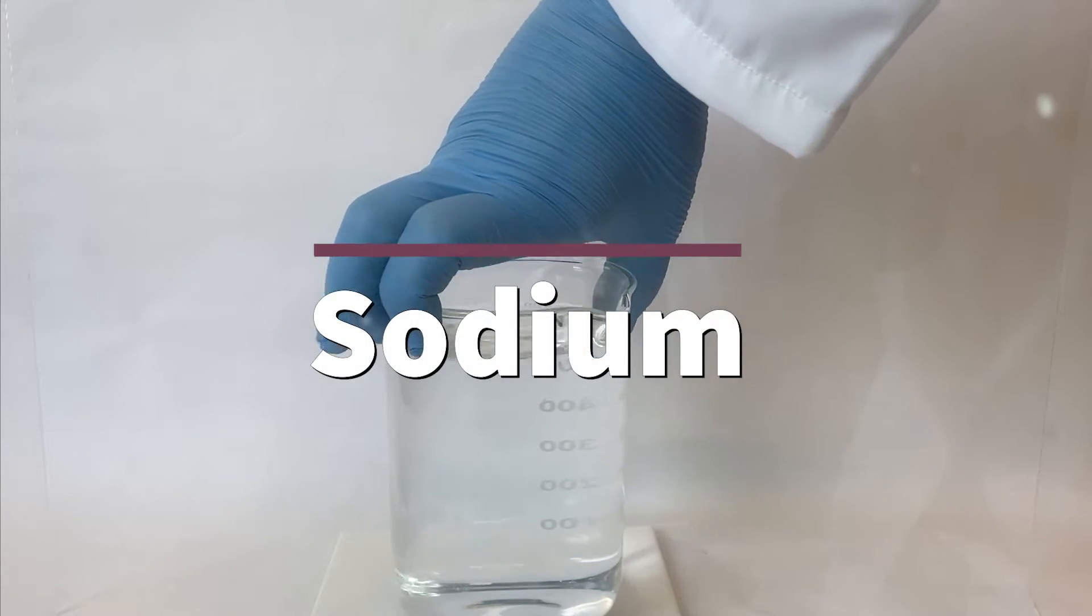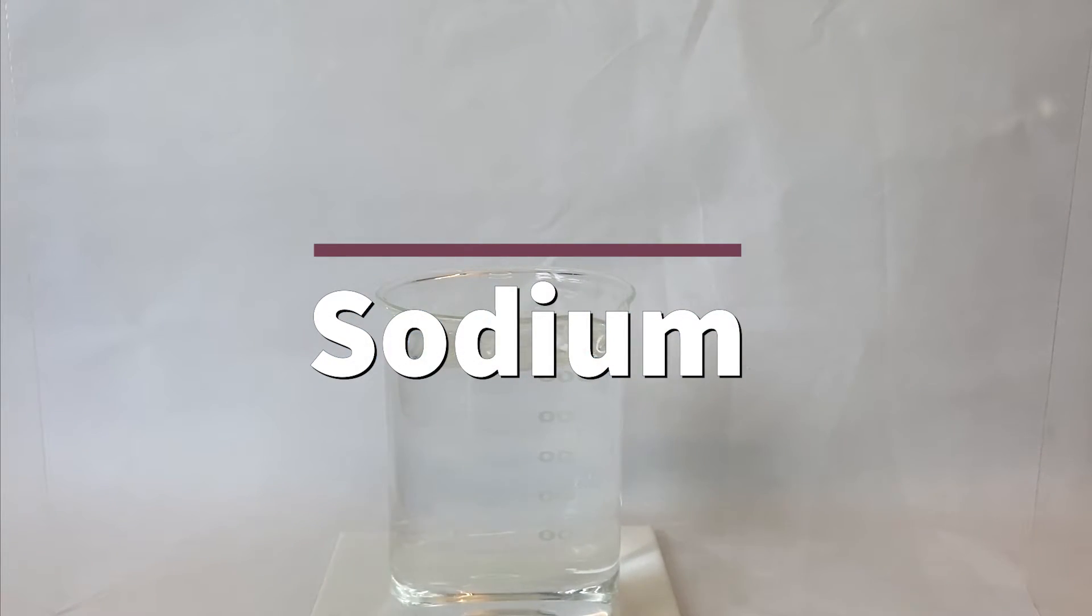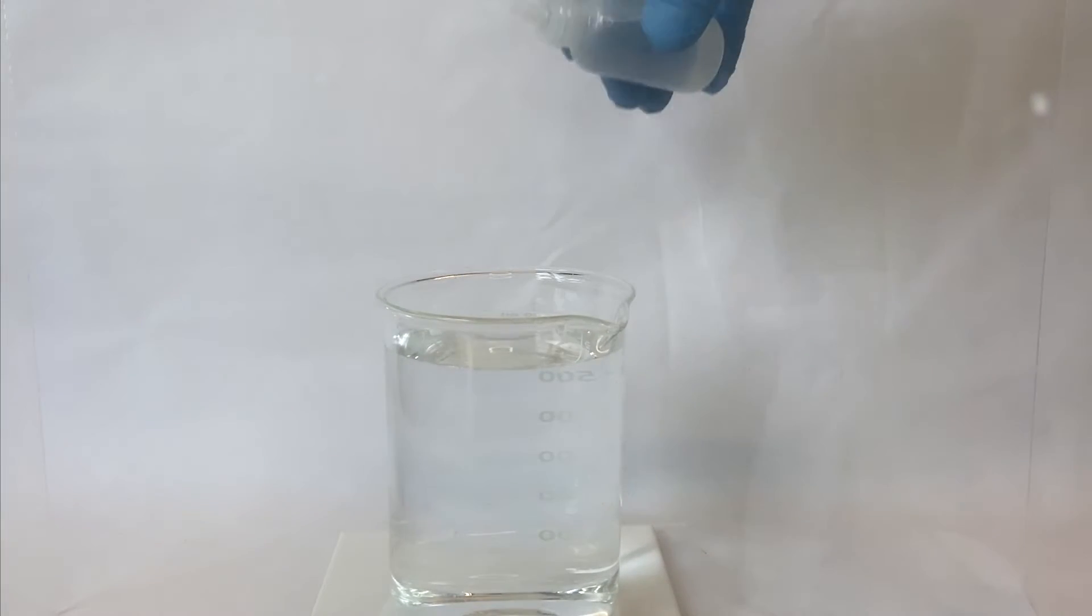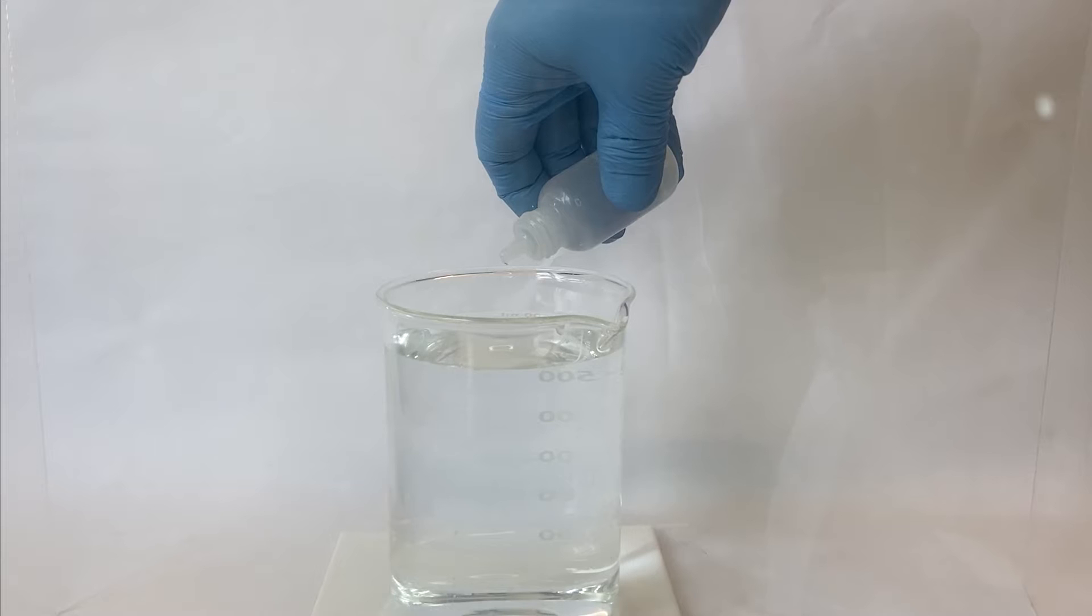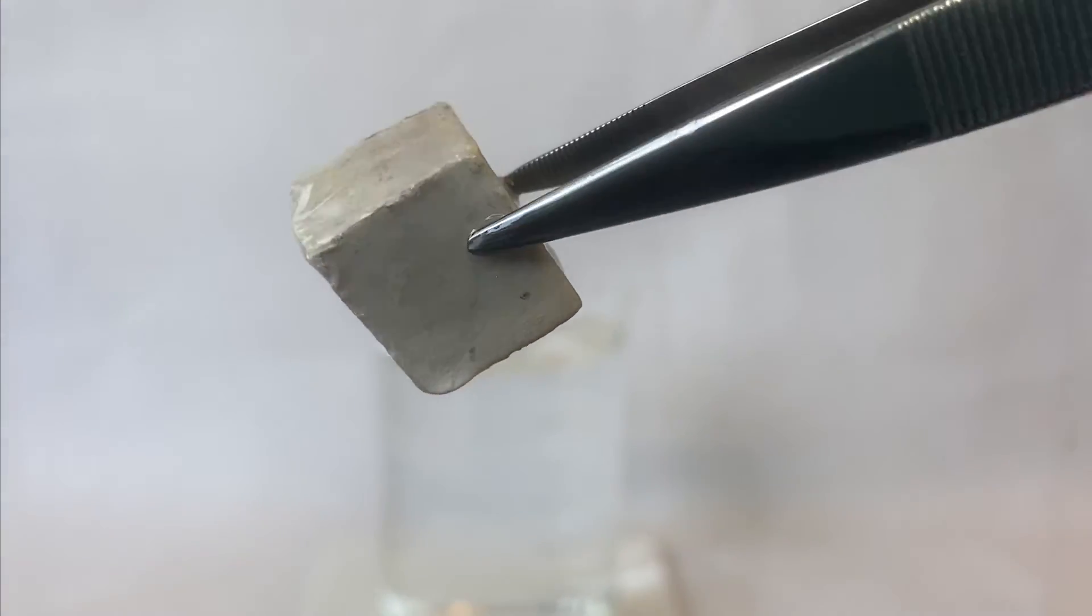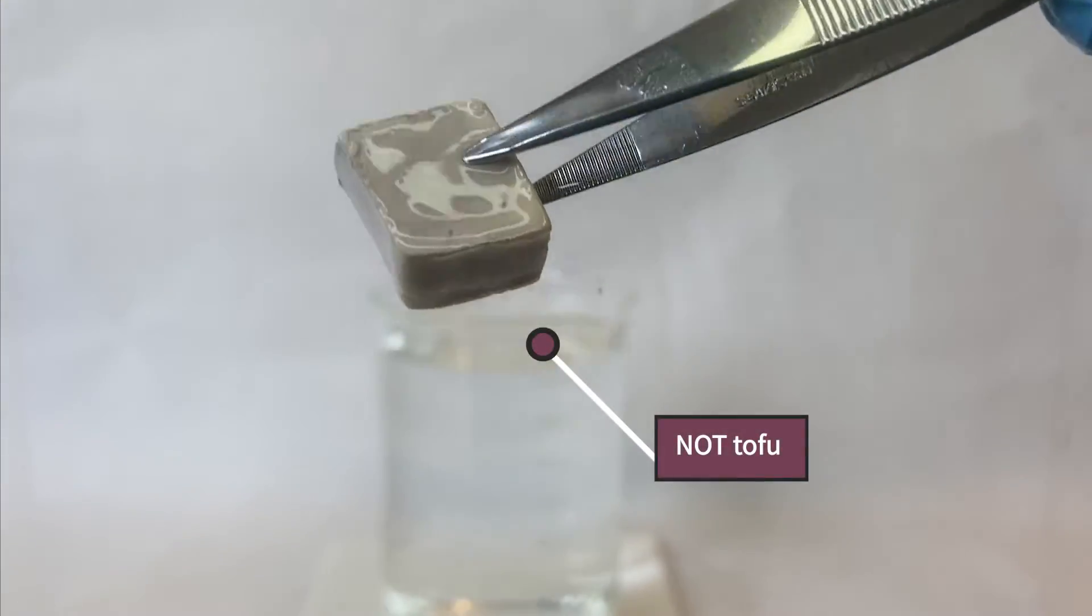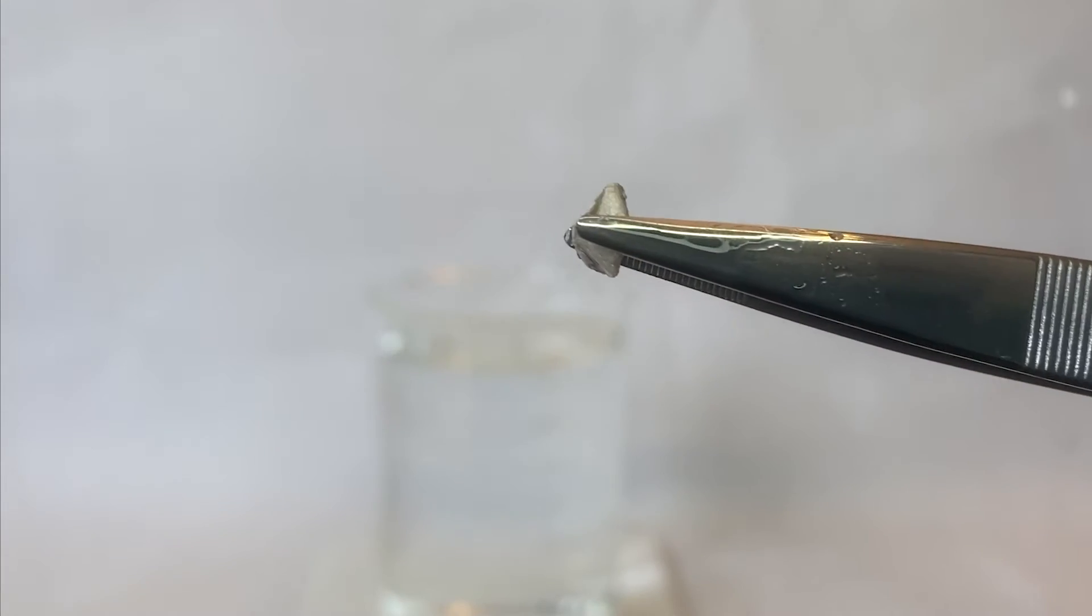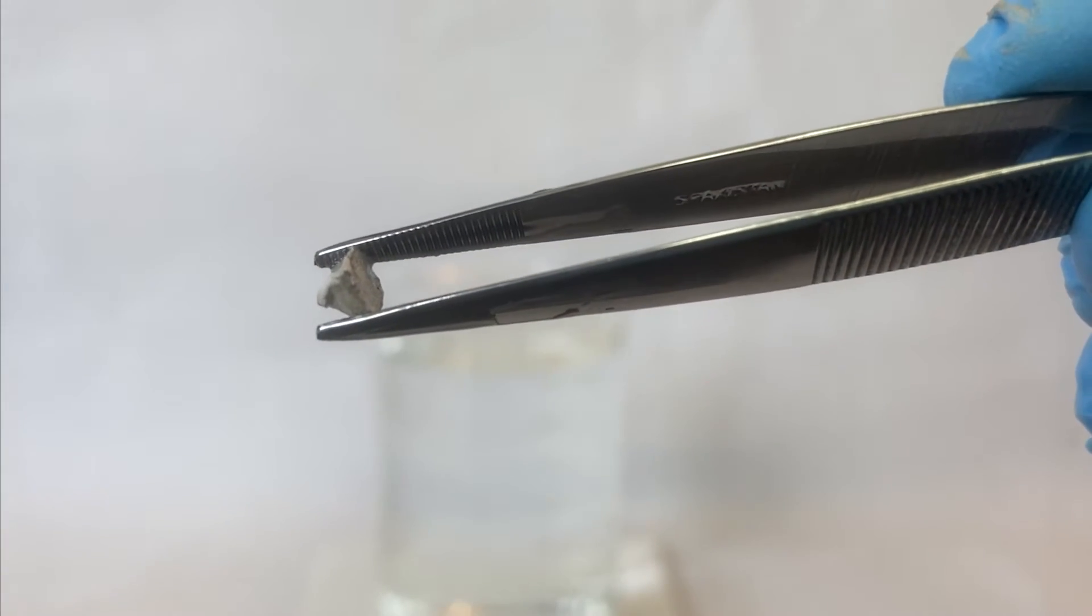Our second demo will be sodium and the setup for this demo is the same. I have a beaker full of distilled water and to that I will add a few drops of phenolphthalein. Not only is the sodium demo really cool, I also think that sodium metal kind of looks like a cube of tofu. That cube of sodium is too big for our demo today, so we're going to use a smaller piece.